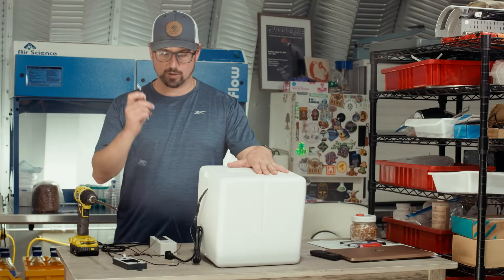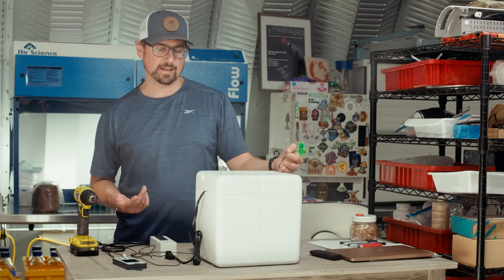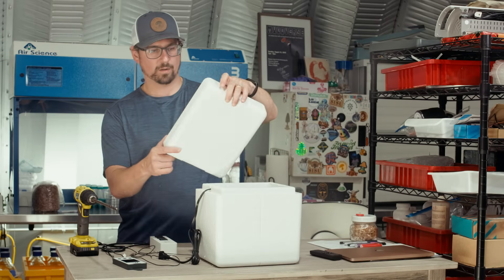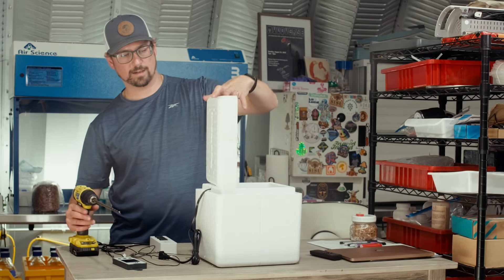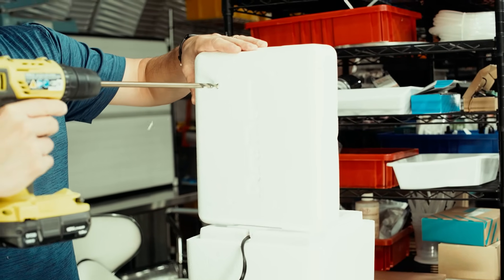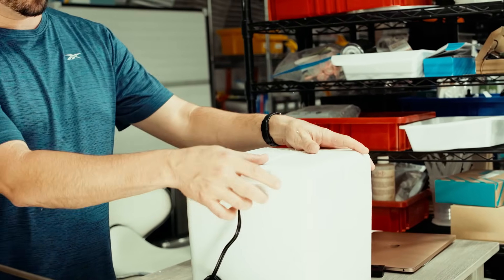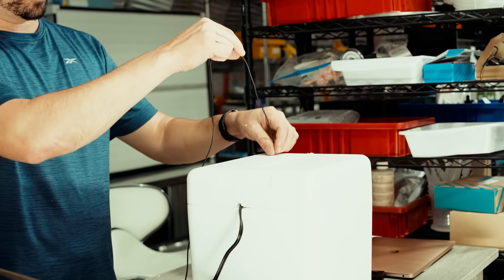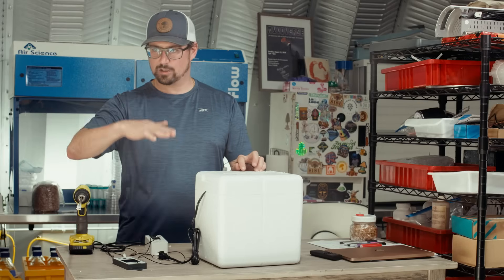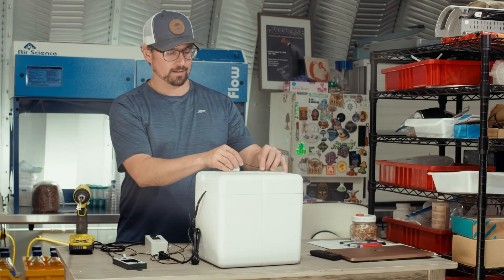Lastly, I'm going to drill a hole for the probe here — this will take the temperature inside the incubator and also allow for some air exchange. It makes a really nice port to place the probe, and this one comes with a suction cup so I can control the depth of the probe according to where the cultures are inside the incubator.